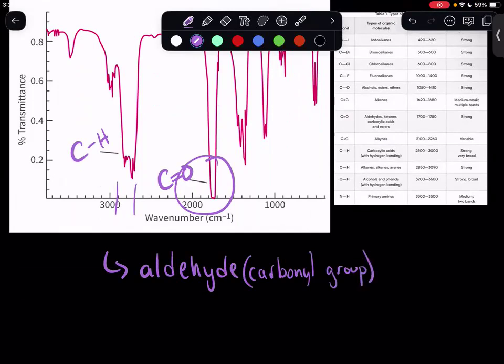And you might notice this CH is also a little different than what you'd expect, but of course it is because it's a carbon that also has a double bond oxygen, so that intensity changes a little bit. And so we're going to see that more spread out, not as sharp a peak as we saw before. So this is how we identify the functional group region of compounds based on IR spectroscopy. This is a skill that you should try and practice as you continue studying for the DP exam.